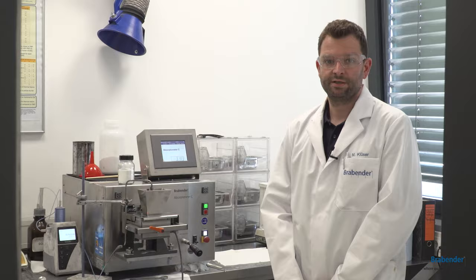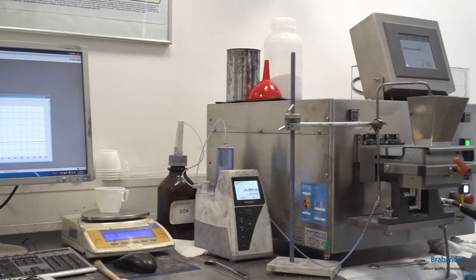Hello together. My name is Mark Lüser. I'm an application engineer for plastics and rubber here at Brabender. Today I will give you some information about the Absorptometer C.